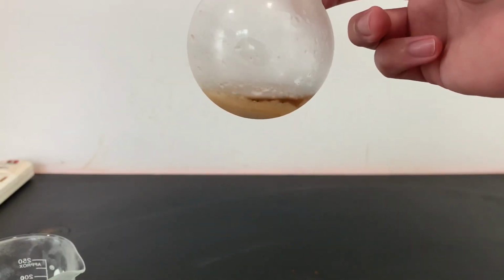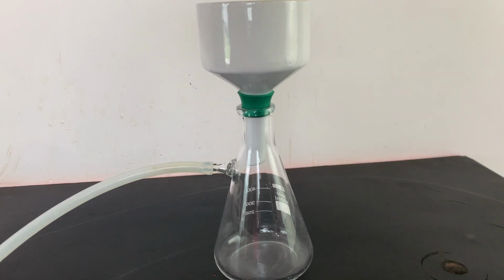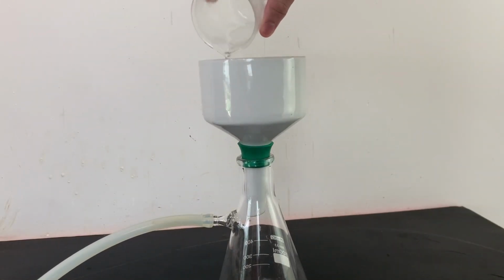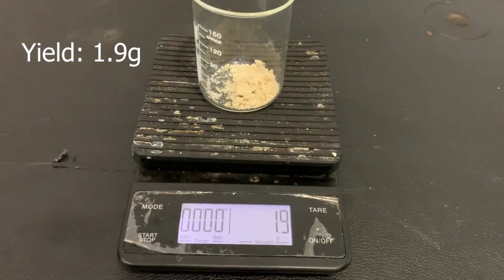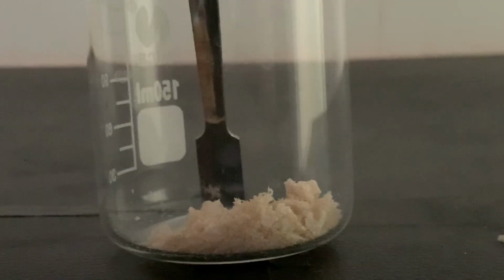After chilling in the freezer, crystals of the N-acetylanthranilic acid crystallized out. I did a vacuum filtration to separate the crystals. I then washed the crystals with ice-cold ethanol. I transferred the crystals to a watch glass to dry. Once it is dry, I measured the yield and I got 1.9 grams.